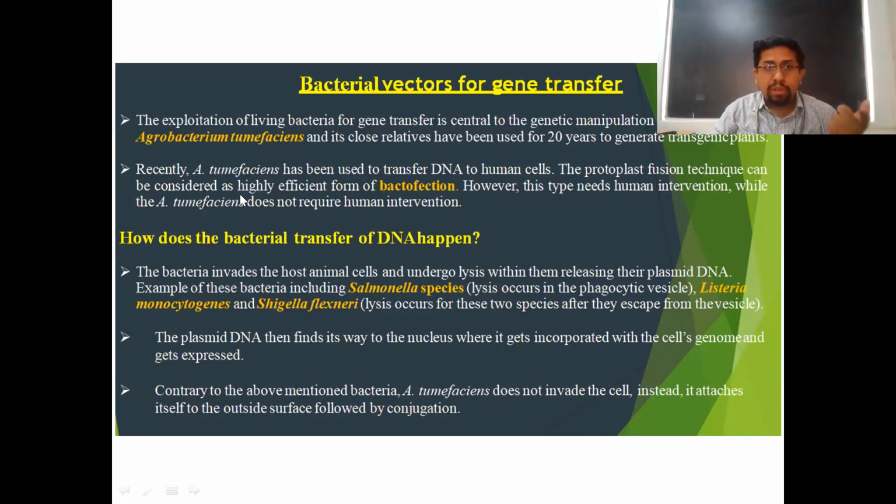How can you do introduction of genes into plants? It is actually very difficult to transfer genes into the plant. You can do a microinjection method at embryonic stem cell level. You can take the embryonic stem cells, the protoplast, and introduce a gene of interest. Yes, that is for transgenic plants. But if the plant has already developed, let us say it has developed certain disease, and you want to render certain resistance against that disease to the plants.